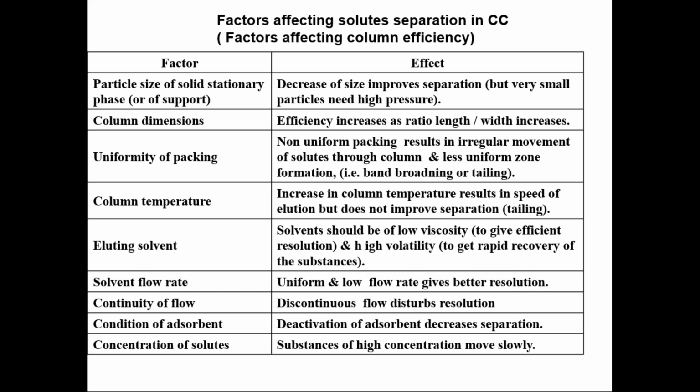The eluting solvent composition also plays a major role. Solvent flow rate: when the flow rate is uniform and much lower, it gives better resolution, and the flow has to be continuous, and so therefore we use pumps, whereas in the lab the flow is not continuous. We have a reservoir and we keep adding the solvent.